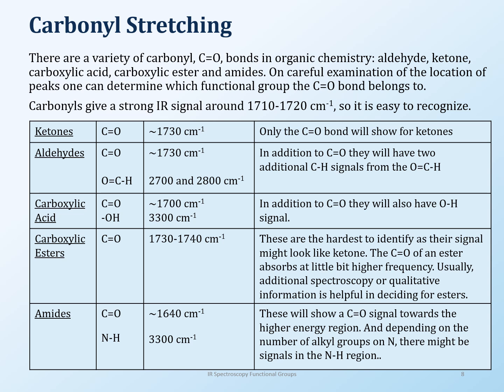Okay, now let's go on to carboxylic acid. When you have a carboxylic acid, you will definitely have the carbonyl peak, but you'll also have an OH peak, because the carboxylic acid is COOH. So you will see an alcohol peak also. Now this can be a little confusing, because when you have a carboxylic group, that's actually, here, I'll write it here. So you have this group.